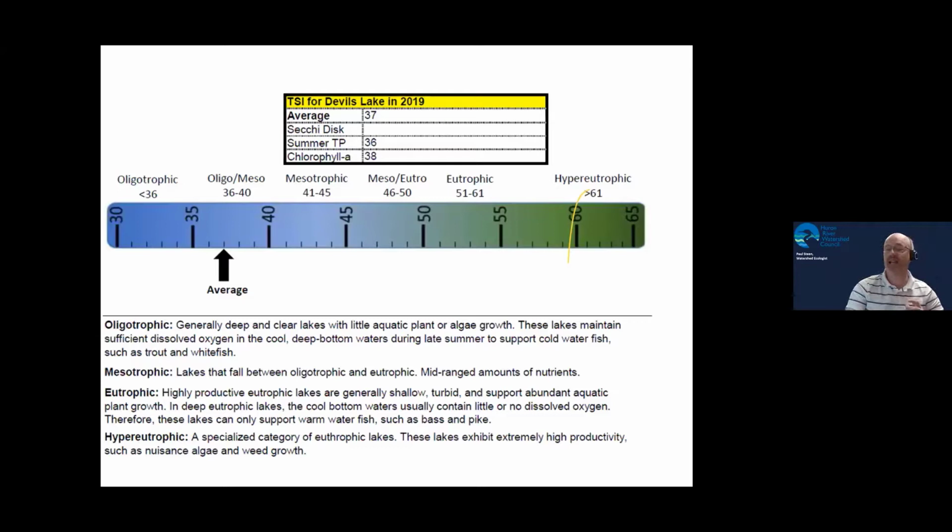Maybe you have a high sediment load, and that is making you have a worse Secchi measurement as compared to a phosphorus or a chlorophyll measurement. If that kind of thing isn't going on, generally the three numbers will all fall pretty close to each other. And usually when you have one strange outlier, it means that something else is happening here that you'd have to think about why that is.